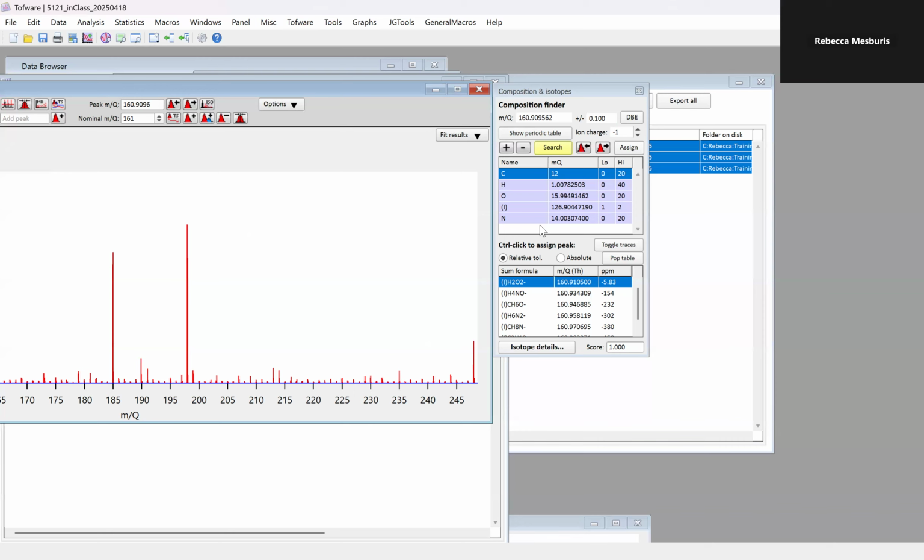And then if I know that I'm not looking for something with nitrogen, I can get rid of the nitrogen by clicking on it. And now it's gone. Then I can research and nitrogen ones don't come up. And wow, now my possible answers are so much emptier.